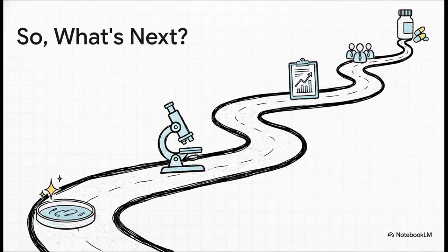Getting a positive result like this is incredibly exciting. I mean, it means our extract is a promising candidate, something worth studying more. But, and this is a big but, we have to remember, this is just step one. Proving something works in a little plastic dish is a long, long way from having a safe and effective medicine for people. It's the start of a very long journey.